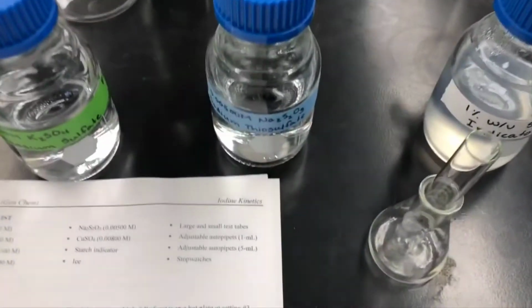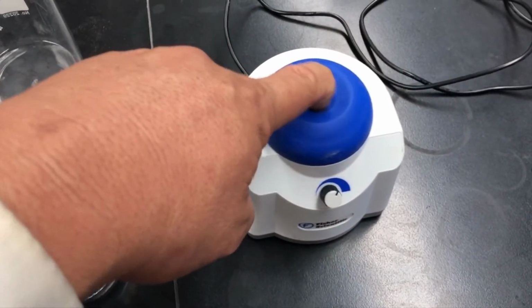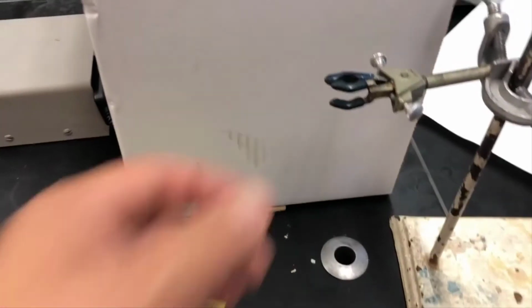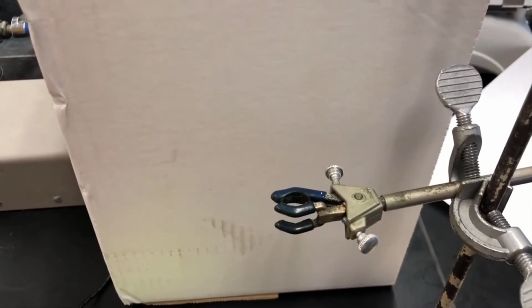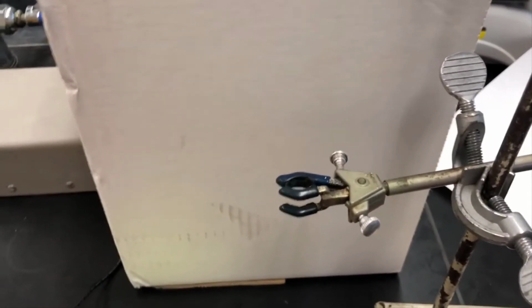Then what I'll do is take the contents of the smaller test tube and place it in the contents of the larger test tube. I'll mix it on my vortex mixer. I don't know if you can see that vibrating, but it's a vortex mixer, for 1 second or maybe 2 seconds. We'll see how long it takes to mix. And then I'm going to have it mounted into this rack. There will be a timer right next to it so you can see the time. And I'll start that timer, or try to start that timer, as soon as I mix the 2 solutions. Okay, so the next thing that you'll see is the 2 solutions right before I mix them, the starting of the timer, the vortexing, and then we'll watch to see the reaction change color.